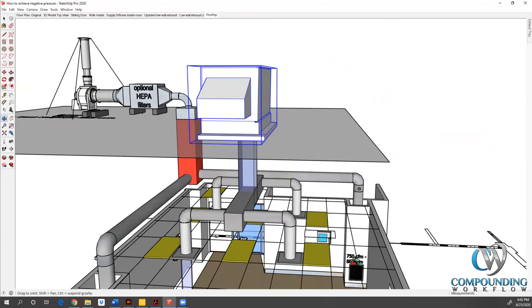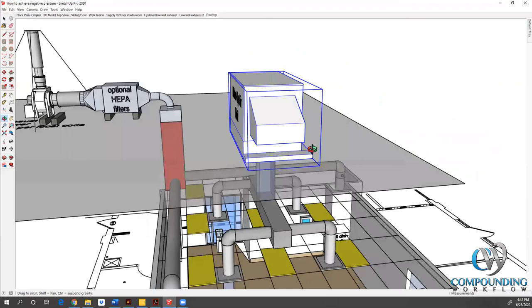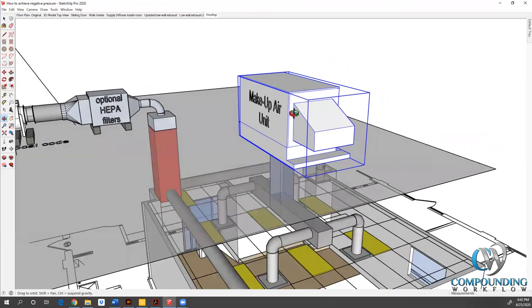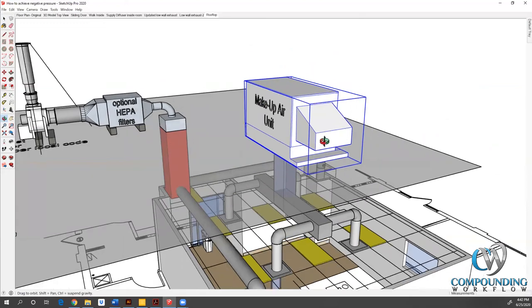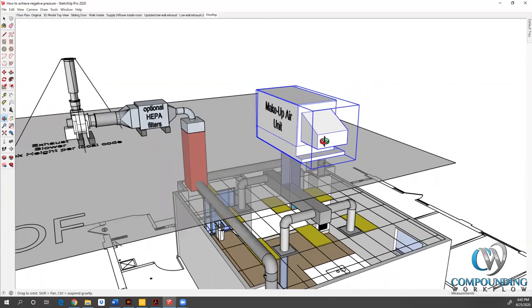You will notice that if we add up 800 here, plus 800 in the other corner, that's 1600 CFM. And remember, I told you this makeup air unit was 1200 CFM. So again, we're pulling out more air than what we're putting into the space. And that is what is achieving negative pressure.